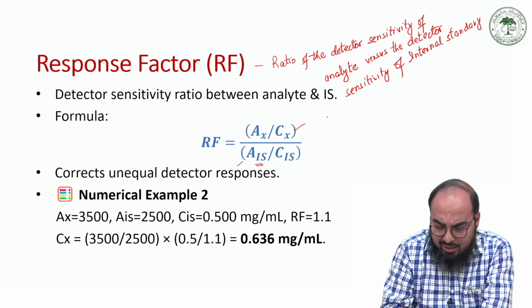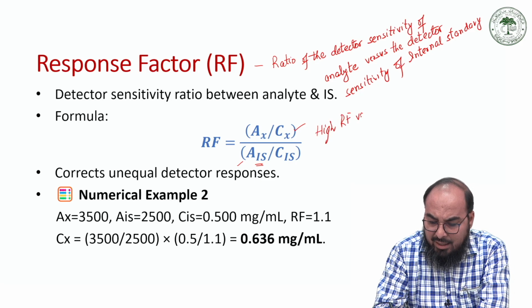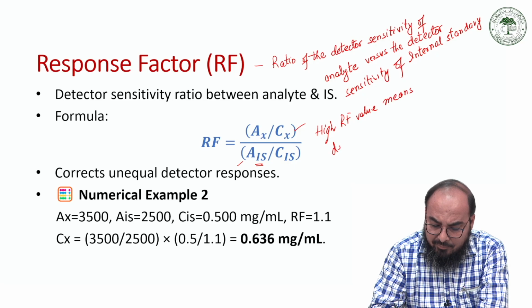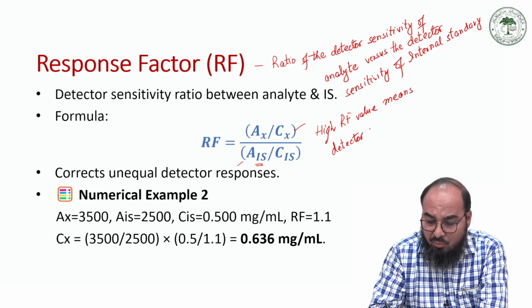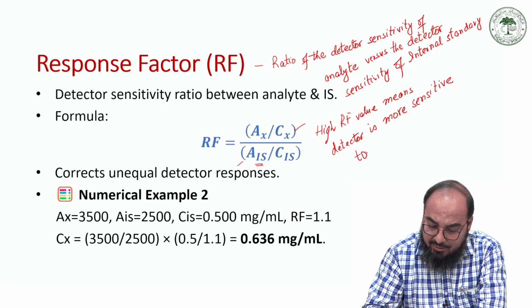So a high RF value means the detector is more sensitive towards analyte.